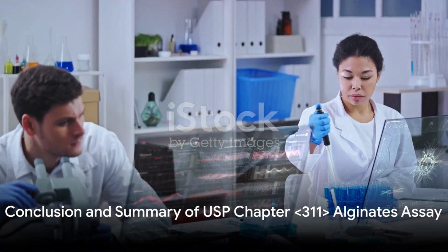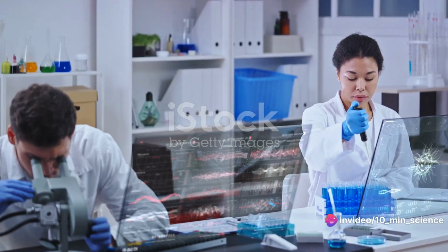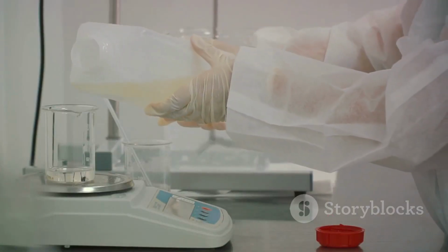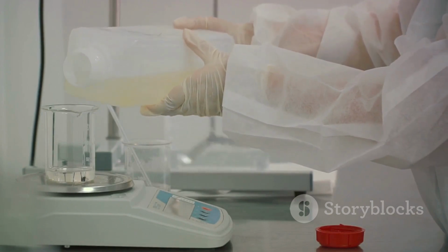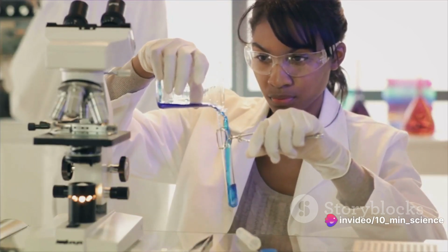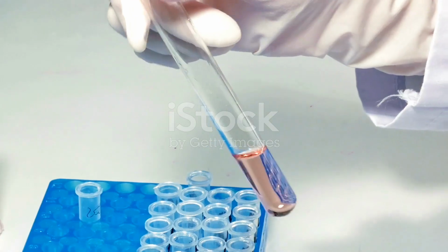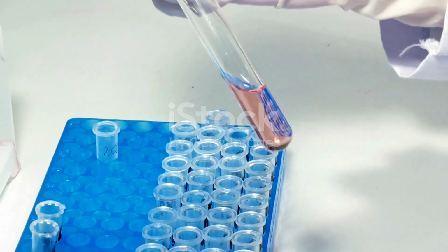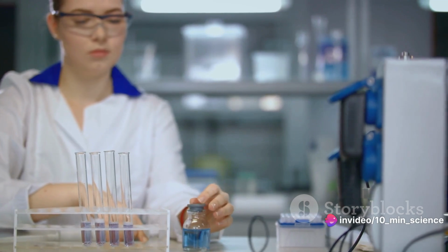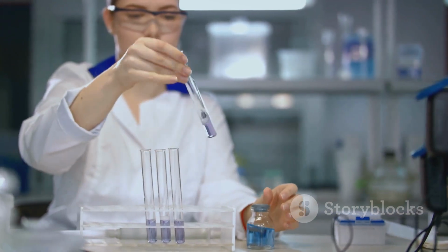In the past few minutes, we've traveled through the intricate process of the alginates assay. We've traversed the landscape of alginates, delved into their complex structure, and explored the depth of the USP chapter <311> Alginates Assay process. We've seen the meticulous steps involved in the assay, from the initial stages to the final determination. This assay isn't just a series of procedures, but an essential tool in ensuring the safety and quality of pharmaceutical products. It's the commitment to precision, accuracy, and rigorous testing that makes the Alginates assay a cornerstone in the world of pharmaceuticals.